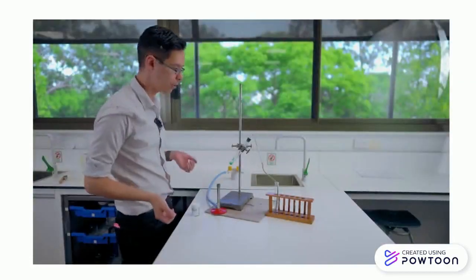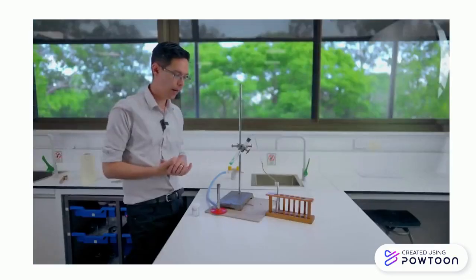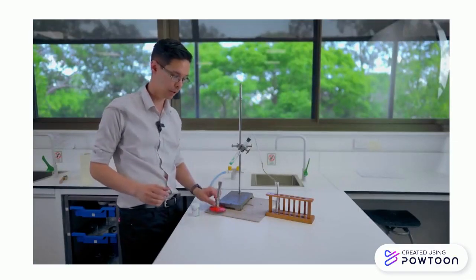Today, we will show you a video called thermal decomposition reaction. We are decomposing a substance, which implies that the starting reactant is a relatively large material, so it's made of many different atoms, or even could be the same type of atom, just multiple of them connected together with chemical bonds. And we are going to decompose it, which means to disassemble it into simpler or even smaller parts. And thermal, meaning temperature, so it requires a bit of heat for this to occur.